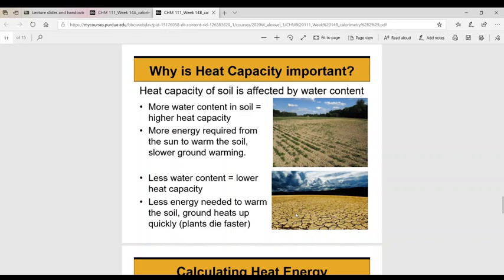So how can we understand this? Well, if this soil has bigger amounts of water, and you can tell that out of logic and common sense, that means that if you would want to take off that water from that soil by vaporizing it, you will need to apply heat, and you will need to apply a bigger amount of heat in here than in here, because in here you have more water, because this soil has more water absorbed, whereas in this case for the dry soil you can see underneath, you will need the least amount of energy to take off the few water you could have within.